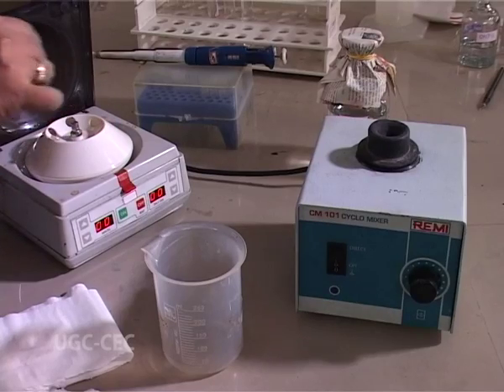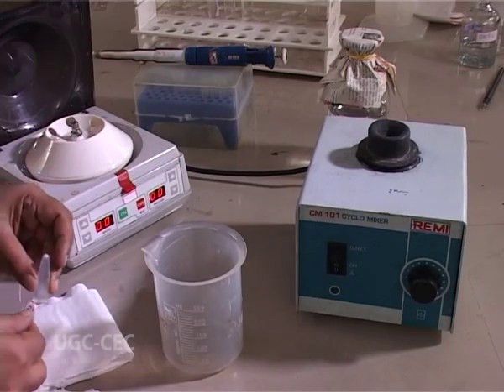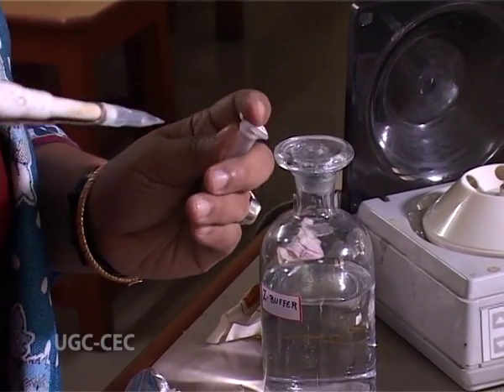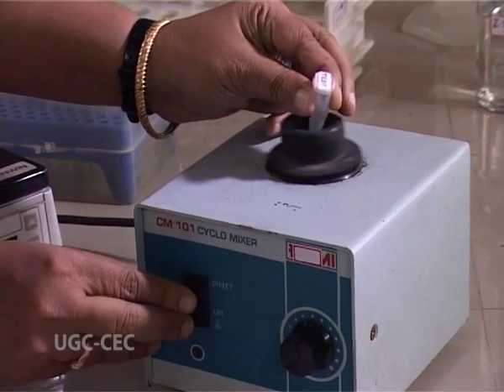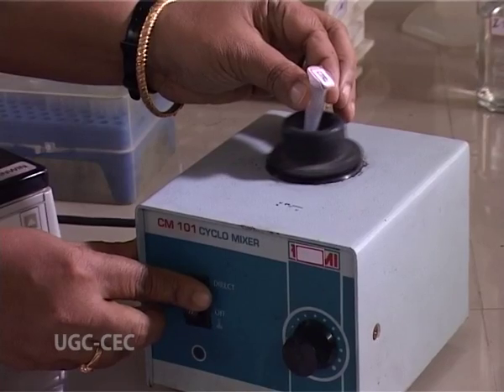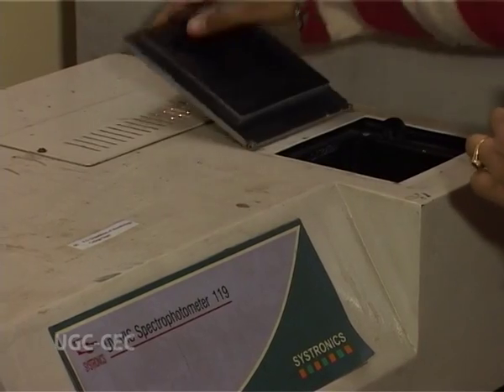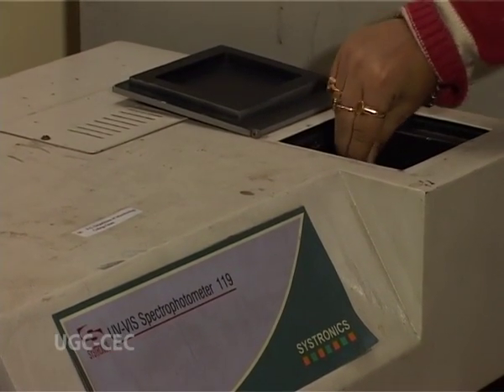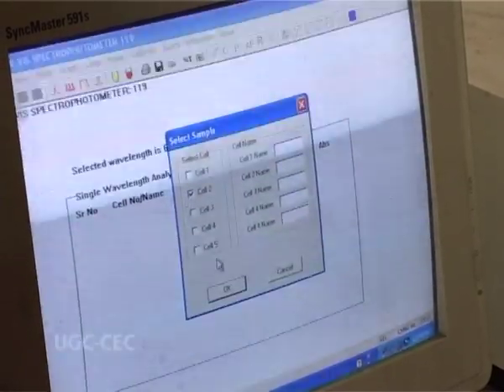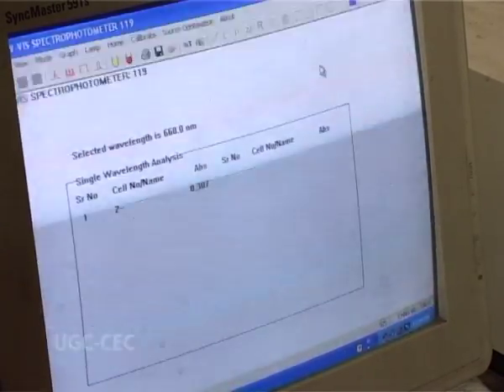After centrifugation, we are going to discard the supernatant and take the pellet. After that, the pellet is suspended in Z buffer, and it is vortexed properly to make a homogeneous mix of the cells. After getting a suspension culture of bacteria, we will be taking the OD of the cells at absorbance of 660 nanometers, so that 5 ml of the culture gives an OD of 0.2. So if needed, proper dilutions are to be made.